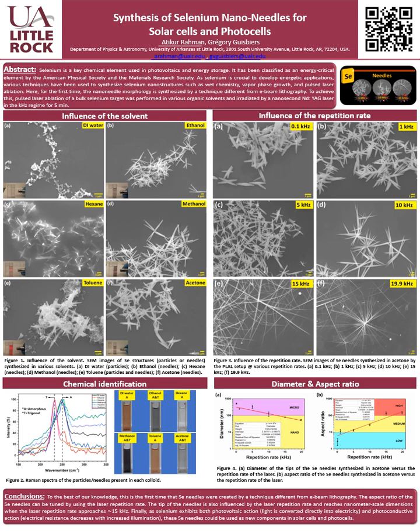We put the bulk pellet inside the solvent and heat it with the laser, and the nanoparticles are synthesized inside the solvent. We store those nanoparticles in the solvent so that they are not exposed to the outside environment.